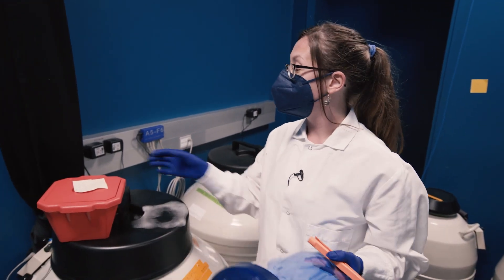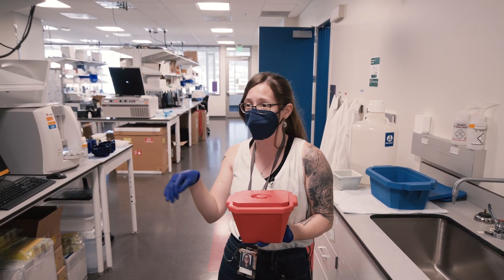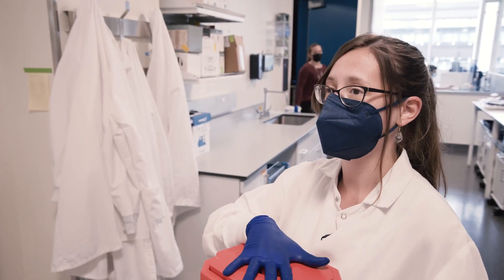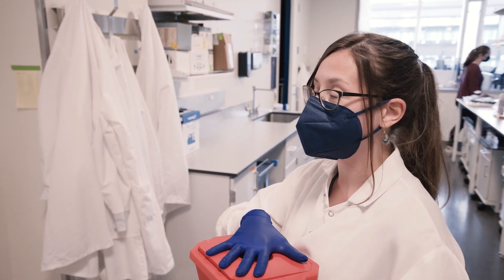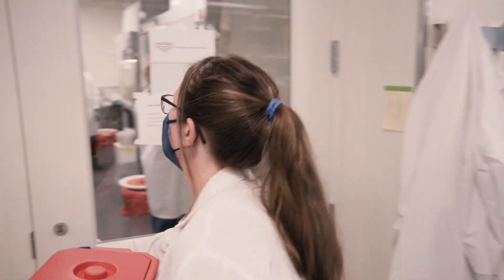Now we can head over into our other lab — I have a couple of team members in there doing cell stuff right now. This is our tissue culture room. I'm going to hand this vial off to Haley and she will thaw it from its frozen state and plate it onto a brand new plastic dish. Let us go in.